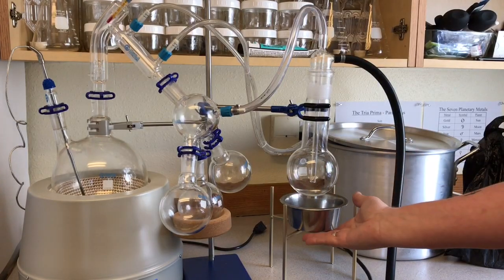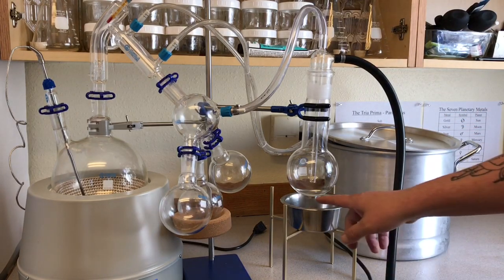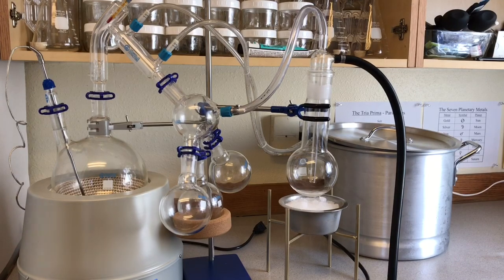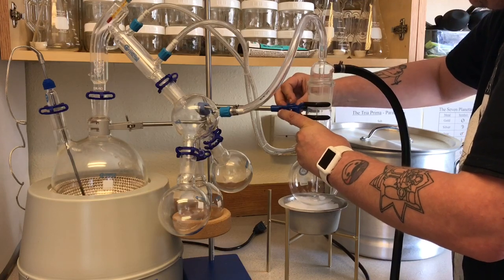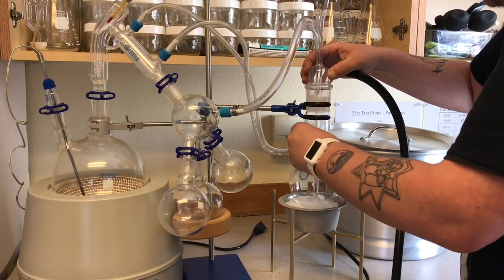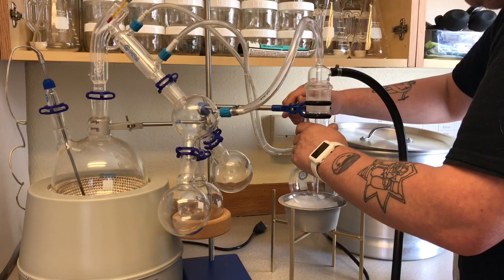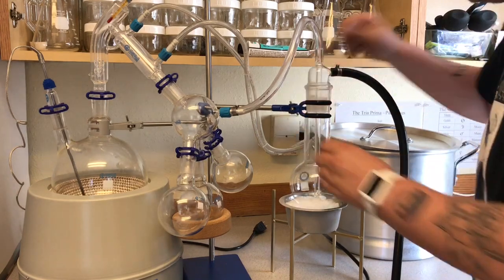So I've raised my cold trap up off my dish here. I've got a bag with some dry ice in it here. I'm going to put the dry ice in here and then snuggle this guy down into the dry ice. Okay, I've got my dry ice in my dish here. I'm going to loosen up this cold trap, lower it down in there. That should be just right. Doesn't need to be tight, just enough that we can hold it in place.